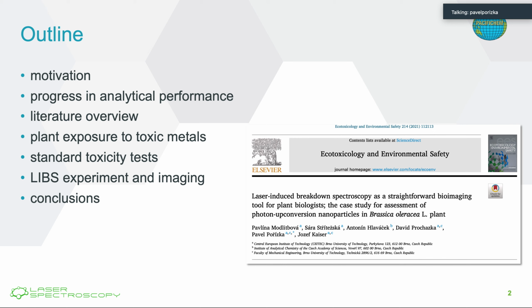Okay, I will briefly go through the outline, giving some motivation, at what point we are with the performance of LIBS, and how LIBS can really contribute to the analysis of plants. Then I will do an overview and a quick deep dive into the experiment, what we are doing, how we are doing it, and what the results are. Then I will conclude with our recent findings. As you can see here, there is a quite recent publication, a sort of cookbook for LIBS enthusiasts and everyone who is starting with LIBS and bioimaging, that can guide you step by step to do quite nice elemental imaging.